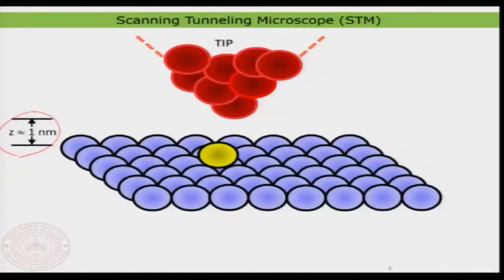But don't worry, it is quite exciting. Nonetheless, you can investigate quite a lot of interesting aspects using scanning tunneling microscopy. So that's the most important thing. So now I apply a bias between the tip and the sample.